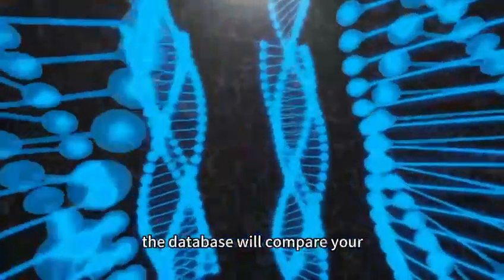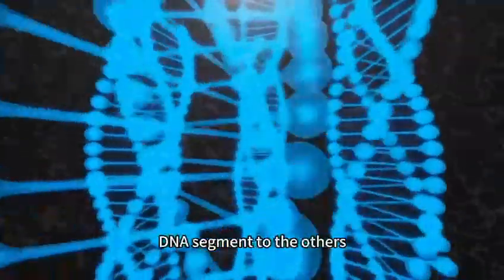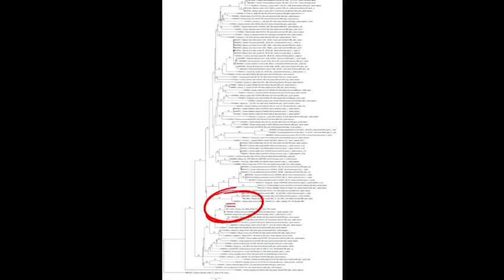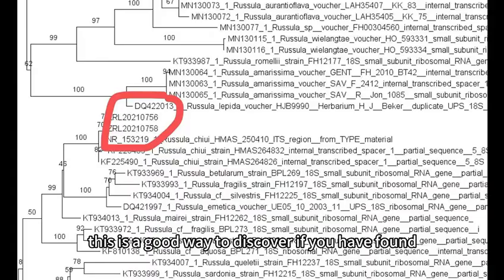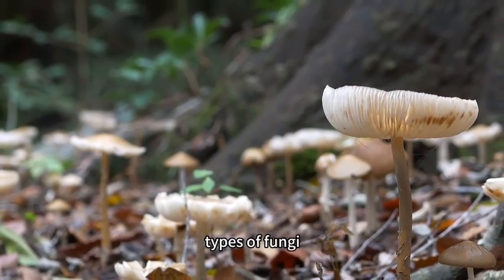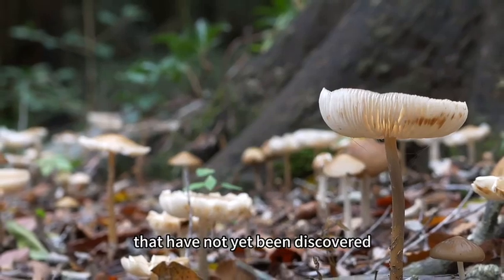The database will compare your DNA segment to the others until you can get something akin to a fungi species family tree. This is a good way to discover if you have found a new species. It is estimated that there are more than 2 million types of fungi that have not yet been discovered.